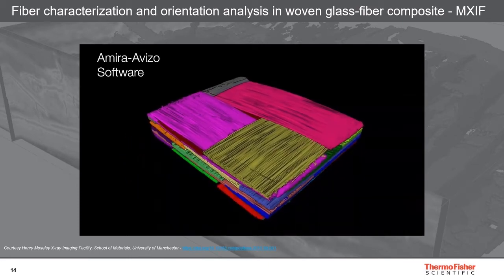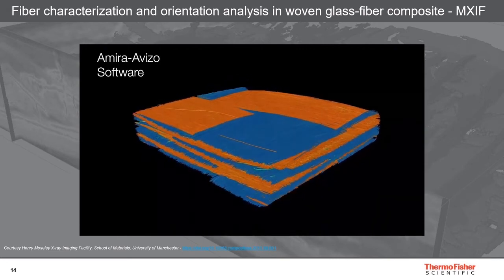Here's a video using Henry Moseley X-ray Imaging Facility data illustrating this use case.